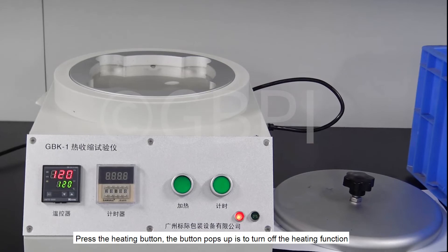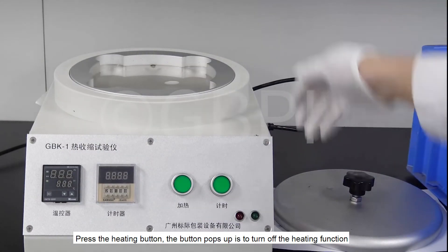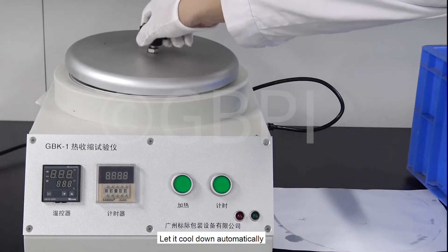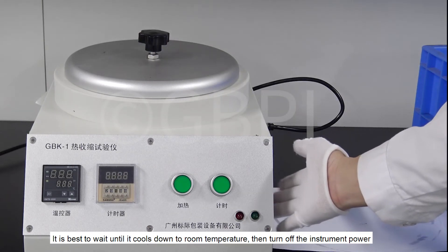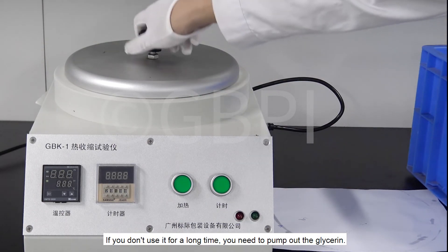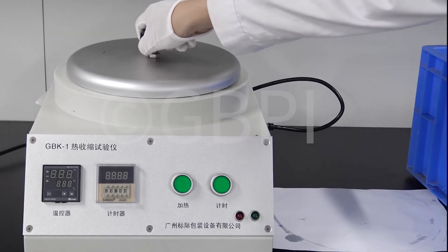Press the heating button again — when the button pops up, the heating function is turned off. Let it cool down automatically. It is best to wait until it cools to room temperature, then turn off the instrument power. If you don't use it for a long time, you need to pump out the glycerin.